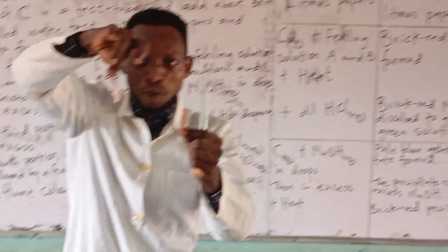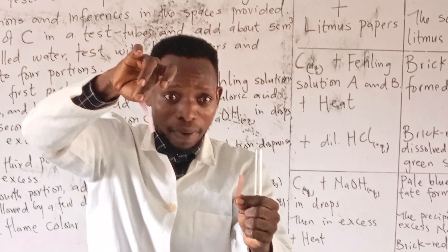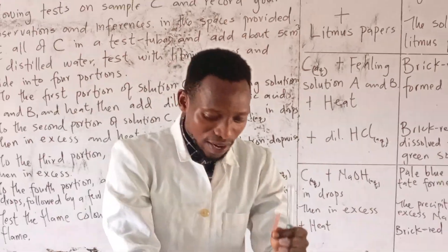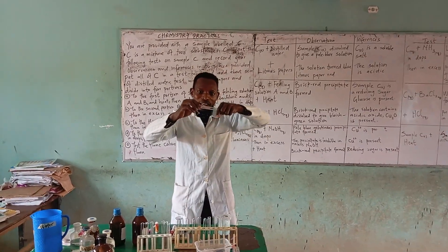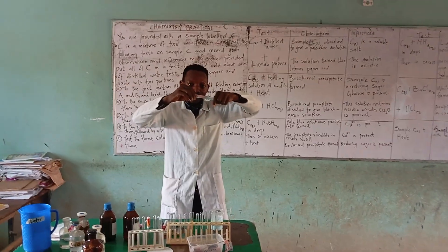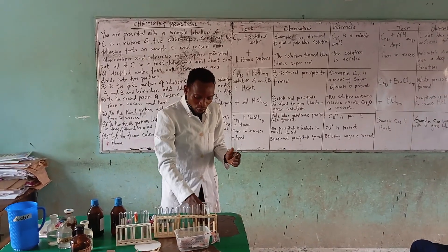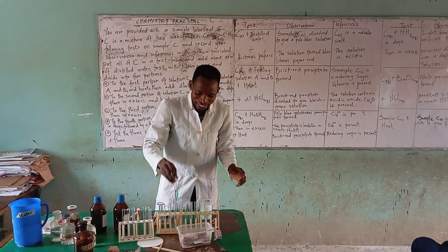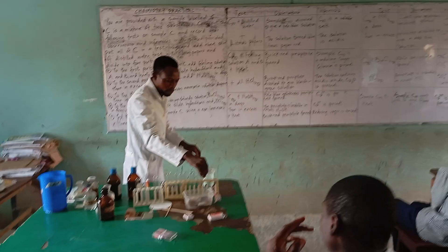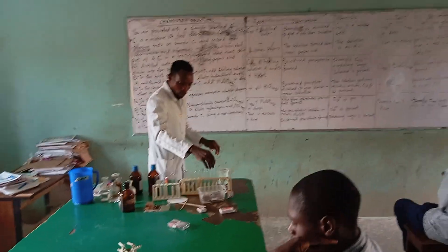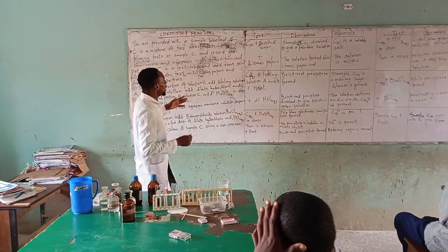Testing our solution with blue litmus paper — see, this blue litmus paper turns red. It has turned the blue litmus paper red. Now let's test with red litmus paper, and there is no reaction here. So it shows that the solution of sample C turned blue litmus paper red.